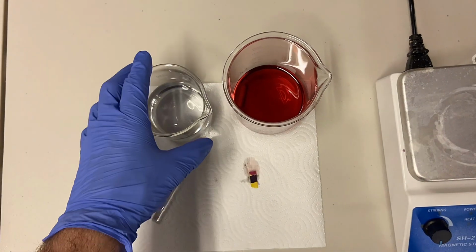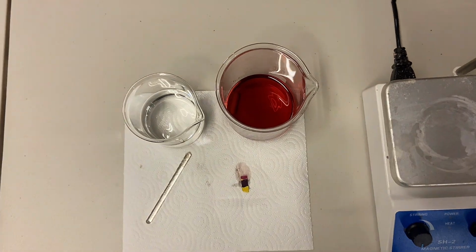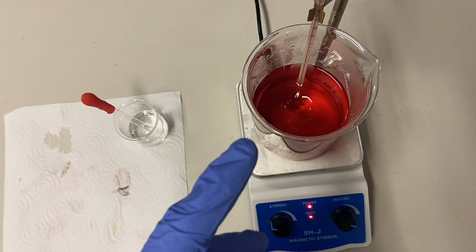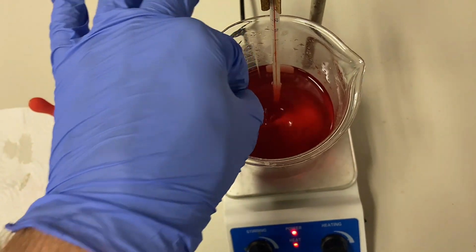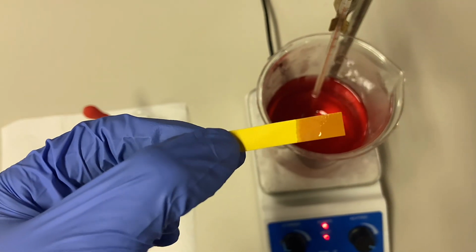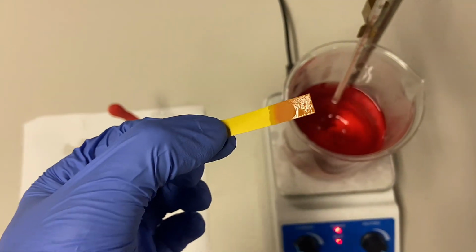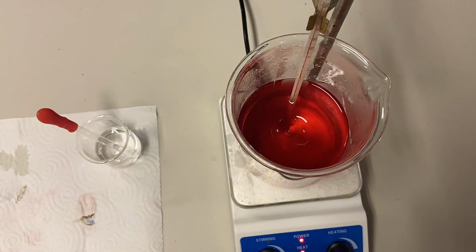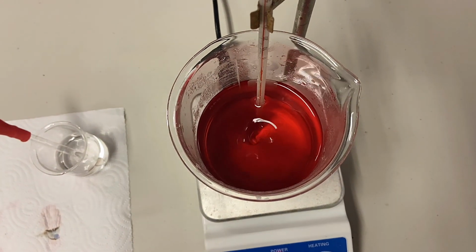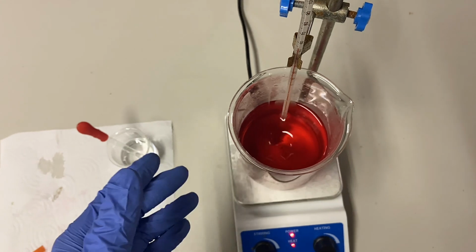So I'm going to slowly add some of this until this gets to the correct pH and check back when I'm done. That went quite well. All of the acid has been pretty much neutralized. If I were to dip it with the pH strip, you can see there that it's really come back to being pretty much neutral, maybe slightly acidic. There's a little bit of red on there because of the actual cobalt in solution. But pretty much all I have to do now is heat it up to around 95 degrees Celsius, just below boiling.